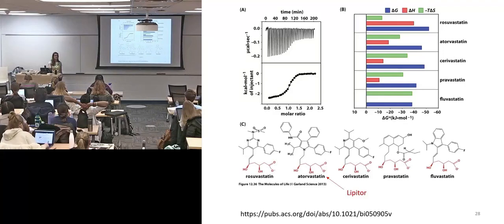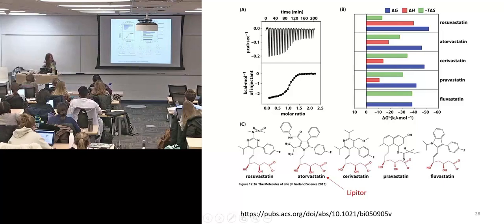So everything has some limitations in terms of our instrumentation. Their report was that it was an unmeasurable amount of change in heat that we couldn't capture with our instrument. We've decided it's approximately 0, meaning that all change to free energy is exclusively entropy driven, and that was their conclusion.